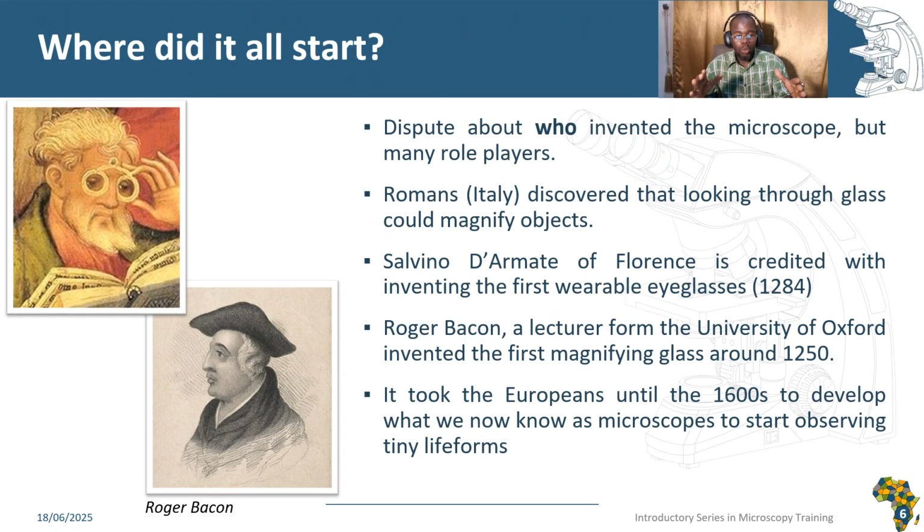Where did it all start? Long ago, Greek thinkers were extremely interested in seeing and understanding the natural world. Though they didn't have the microscope, they imagined tools that could help them see the unseen. That is how the idea of seeing the small started.